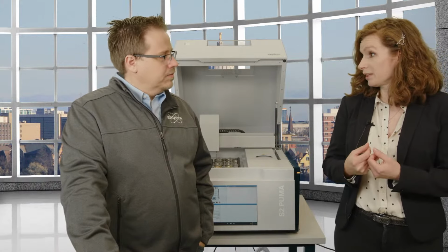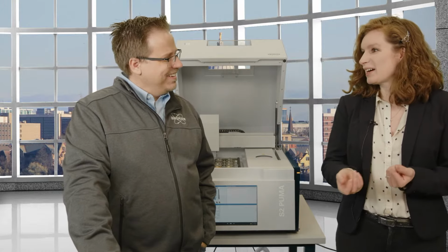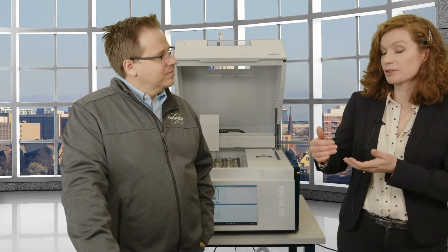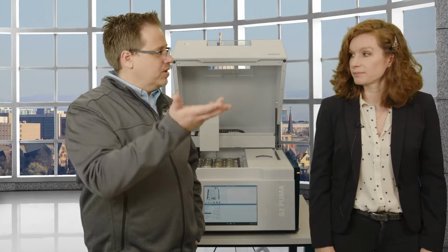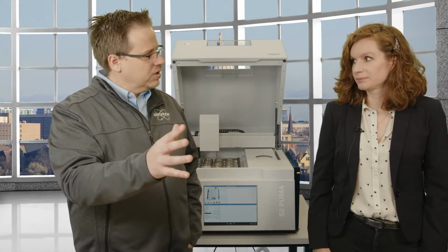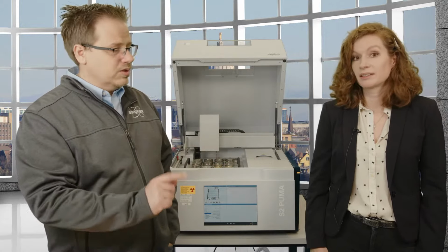But instead of looking at the crystal and wanting to know the 2D, we want to know what goes into the crystal because we do know the structure of it. So it's just kind of reversing Bragg's law there, right? Correct. In XRD, we know lambda and we're looking for D. In WD, we don't know lambda, but we do know D. So that's a great setup.